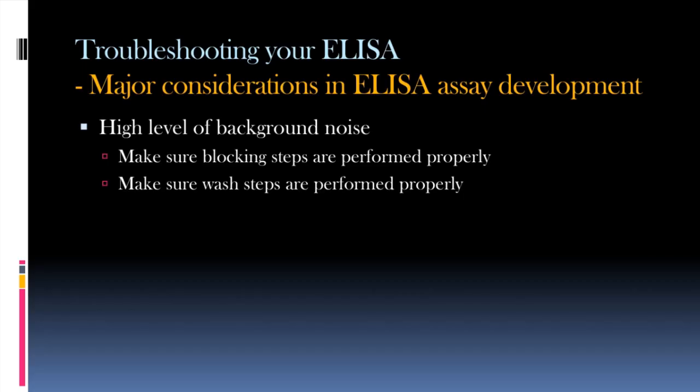And it's important when you do those washes to discard all of the wash buffer from those wells. This is done by tapping very briskly on an absorbent sheet of paper. Sometimes we want to be very careful with the plate and not break it, so we don't do this as vigorously as we should, but it's very important that your plate is almost dry after your wash steps.